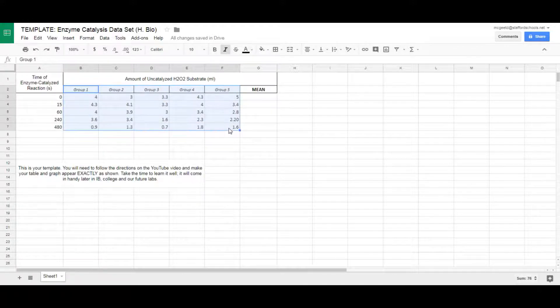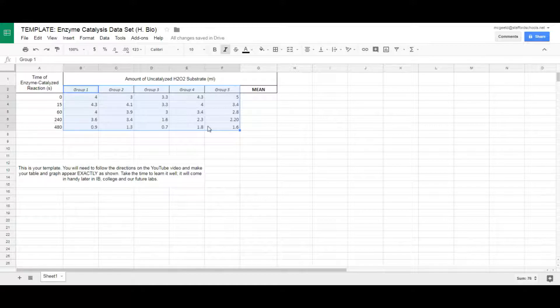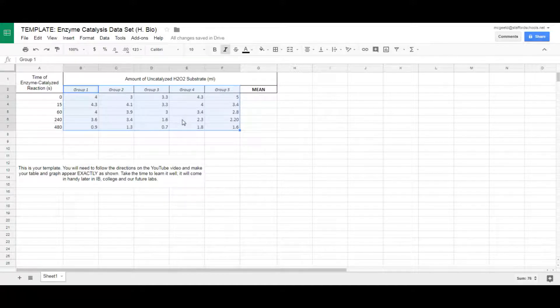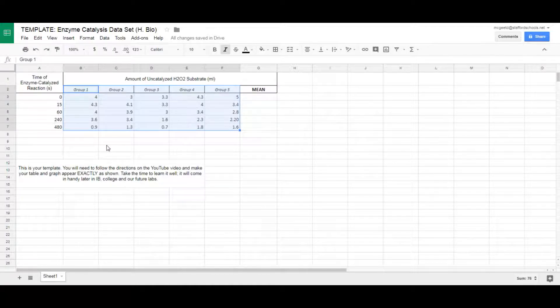Let's go ahead and get started. These are our results from the other day. We had six groups in total — I'm not sure what happened to one of my groups, but I seem to have lost their data. Regardless, this is the data that you provided me, and we're going to make this look a little more tidy.